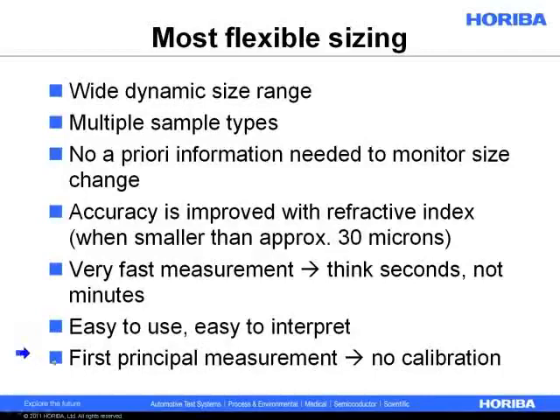And something that maybe we don't talk about often enough is that laser diffraction is a first principle measurement, which essentially means that we don't need to calibrate it. We don't need to teach the analyzer what is the correct size and what's not the correct size. And the reason that's important is it doesn't fall out of calibration. The instrument is either working or it's not working. And that allows us to have a little bit greater peace of mind with the results.